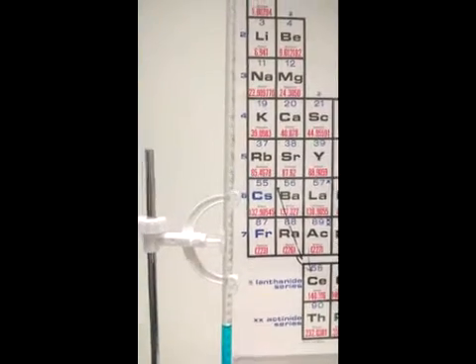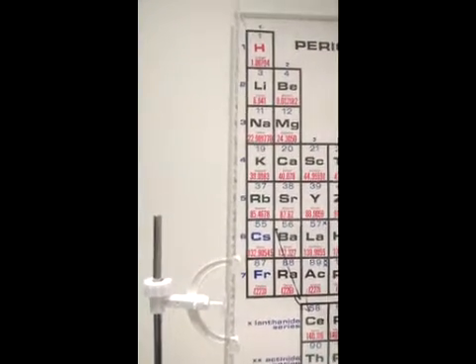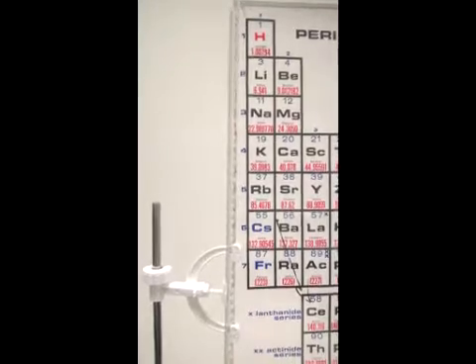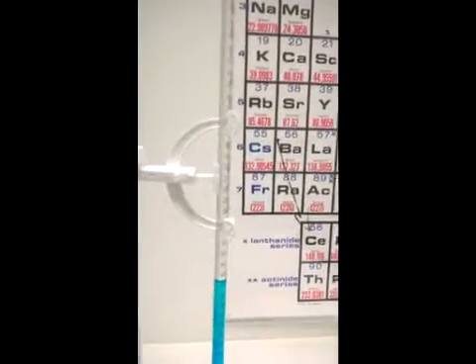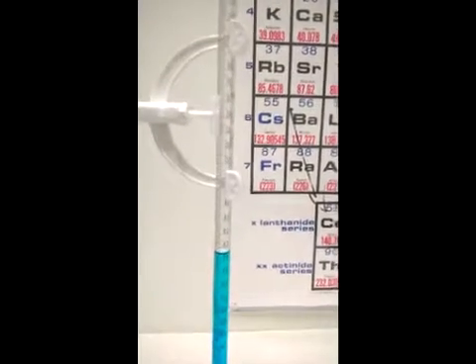How to read a burette in chemistry. Unlike other volumetric instruments such as the graduated cylinder, burettes are read by estimating the second decimal place.